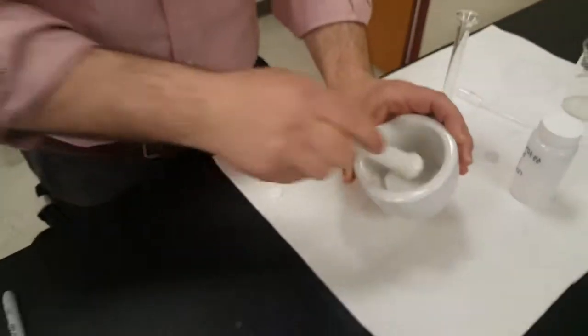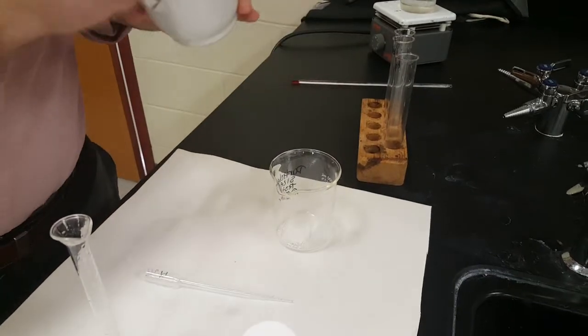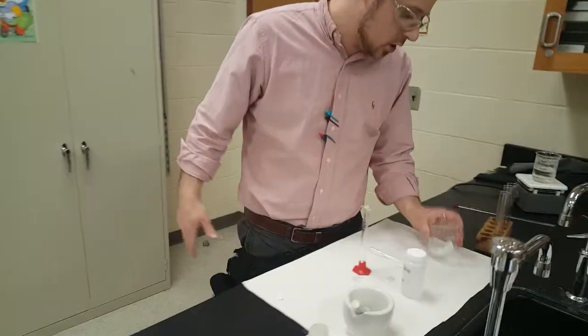Okay. Now we got to get as much of this as we can into our beaker. Because remember, guys, if we're doing a tablet each, we want there to be about the same amount. So don't break the thing, but get as much of it out of there as you can. If you use a half a tablet, obviously it's going to react faster than a whole tablet. So you got to try and get it all in there.